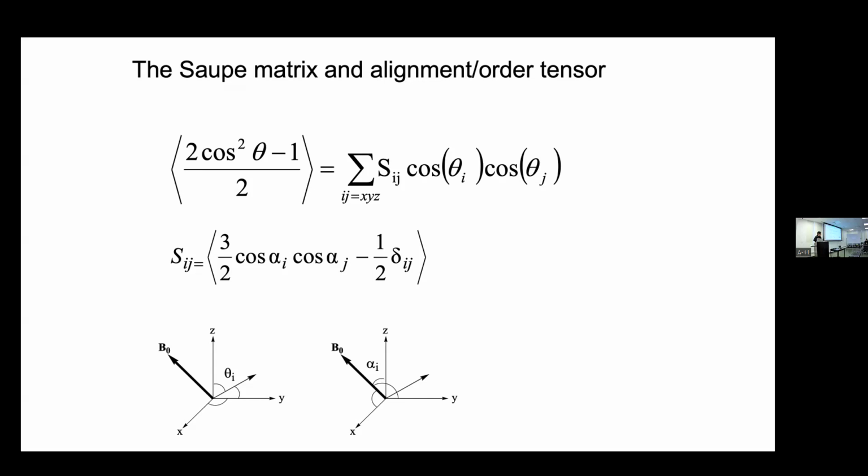And if anything, putting in an ordering medium, like a membrane mimetic or a phage rod, probably brings you a little closer to reality. So even if you had chemical shift perturbations, I wouldn't freak out, because presumably your sample will also change inside the cell when you do in-cell NMR.